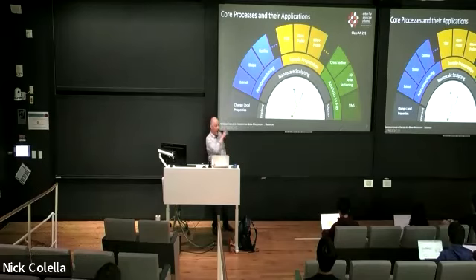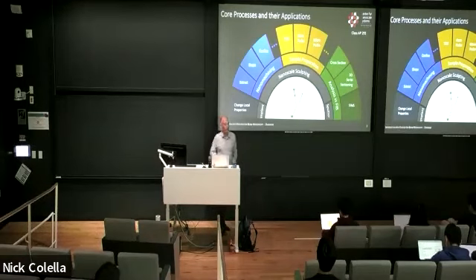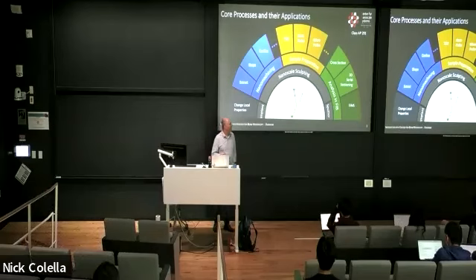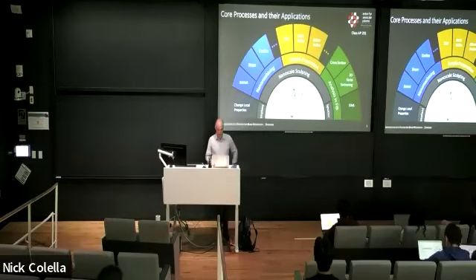We are using it heavily within the facility to prepare samples. It is a helper tool for other instruments like transmission electron microscopy and atom probe particularly. And the instrument has now evolved to be an outright analysis tool on its own. And in particular, it is very powerful in doing 3D imaging on the nanoscale. And I will show you an example later.